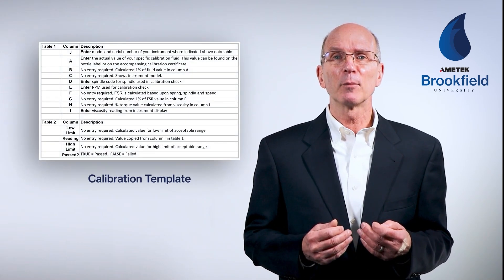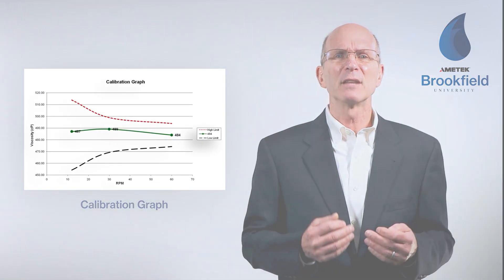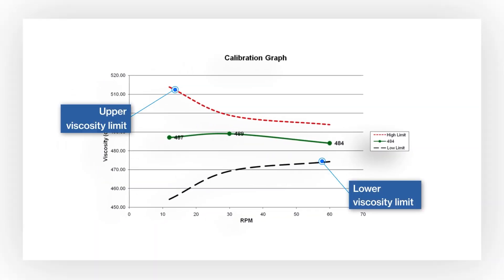Once the calibration check is performed and results are entered into the calibration template, the calibration graph can be viewed. It displays the upper and lower viscosity limits as well as the actual result. If the green line falls outside the upper or lower range, the instrument is out of calibration. If results are high, the viscosity standard may not have been at the stated temperature; if results fall low, the standard's temperature may have been higher than stated on the label.